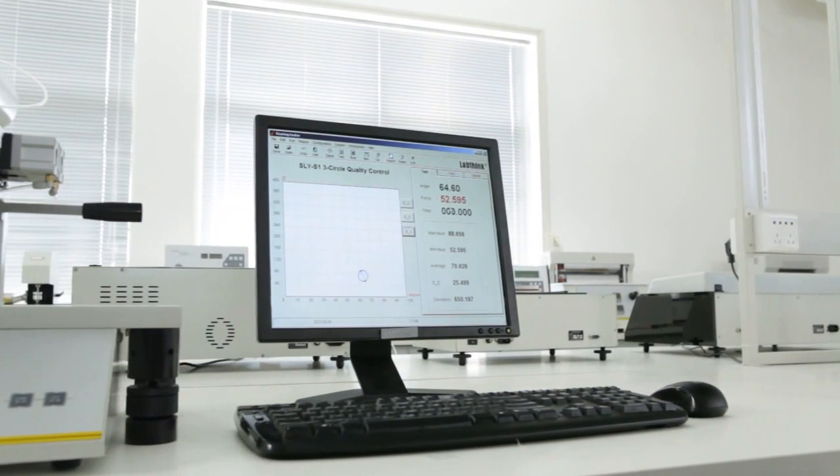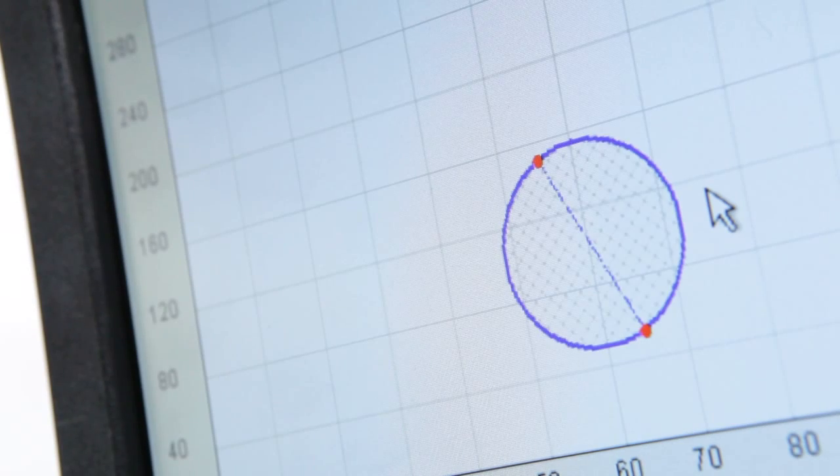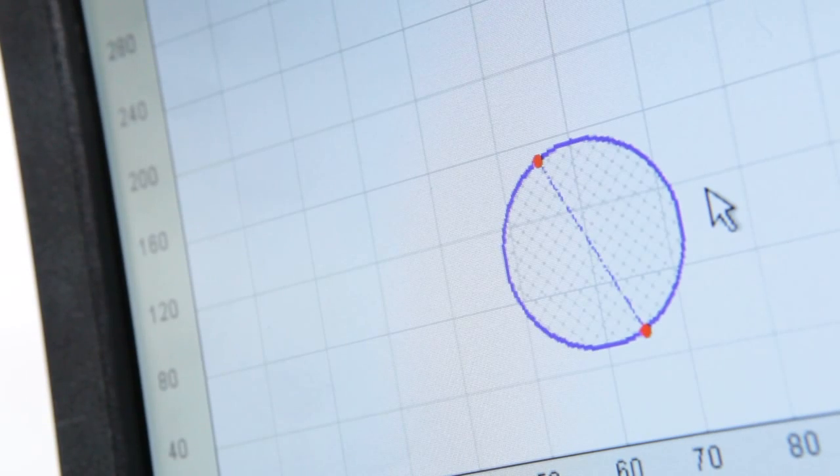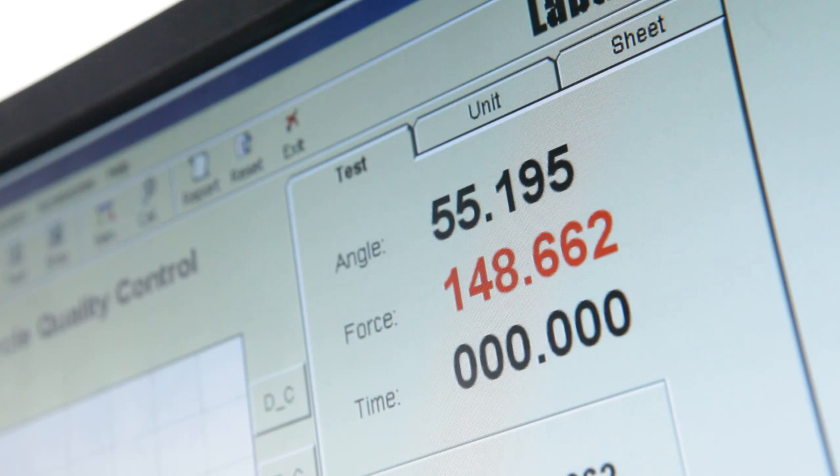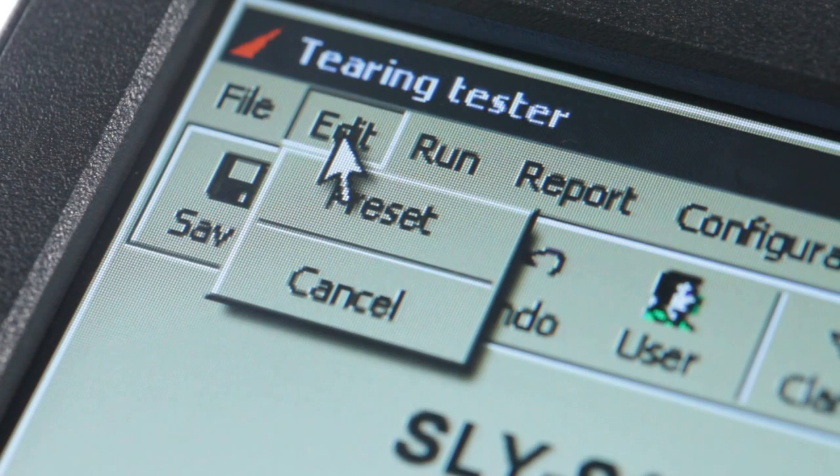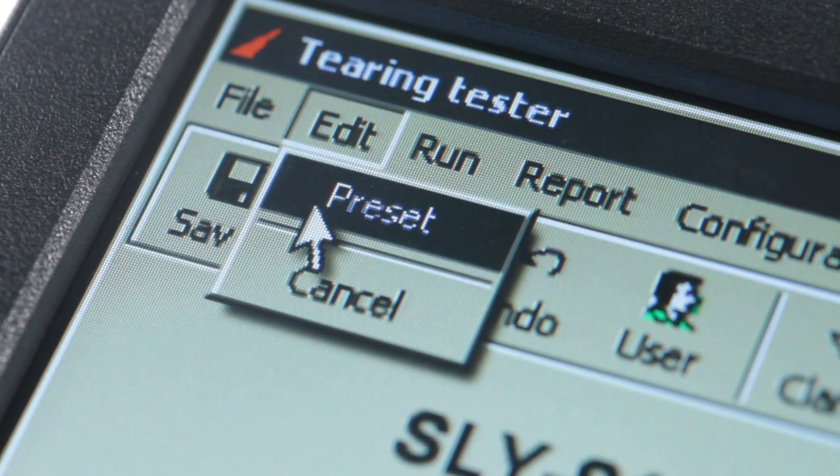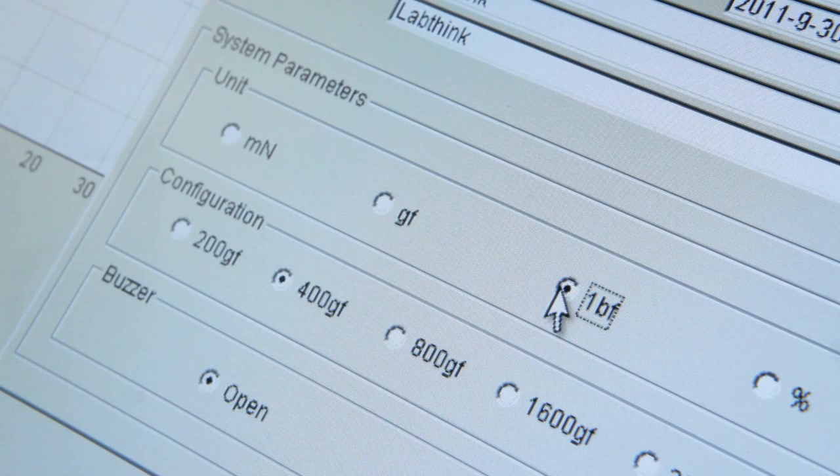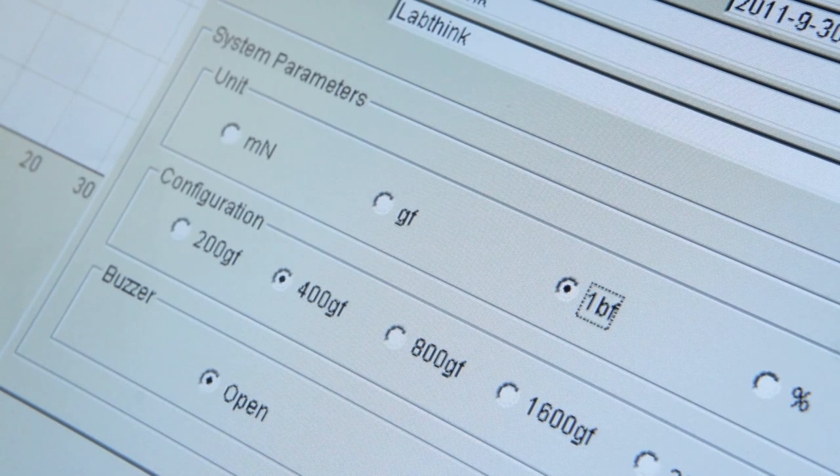The testing software designed by LabThink has an intuitive operation interface and visual display of real-time data and graphs. The testing range can be easily extended by changing the augmenting weight. The corresponding testing range and preferred testing unit can then be selected in the software.